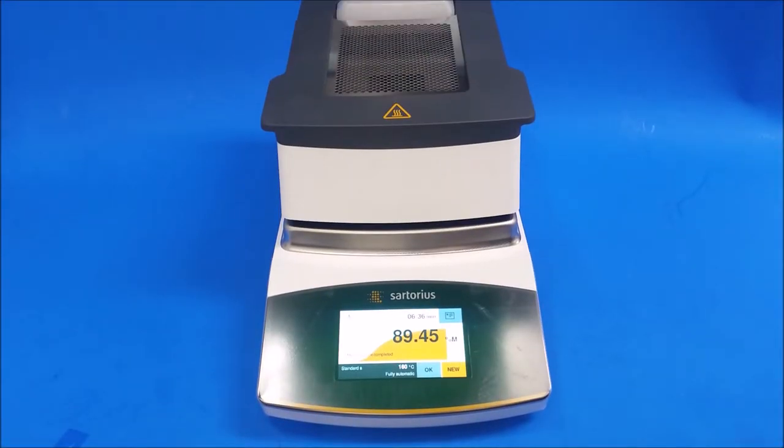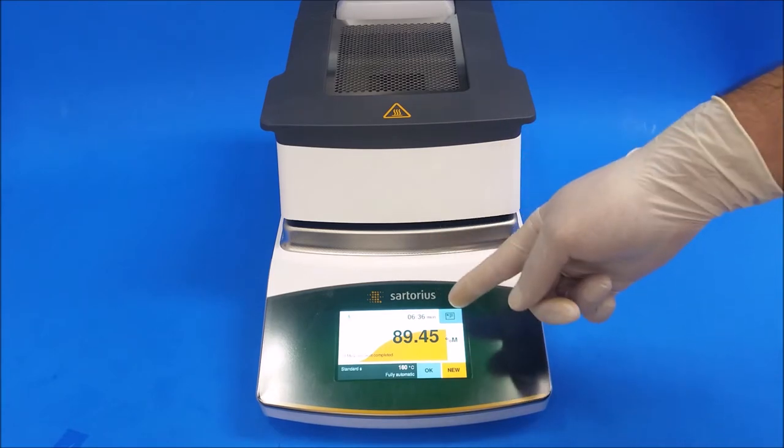Once it's finished, you get your results and the time how long it took.